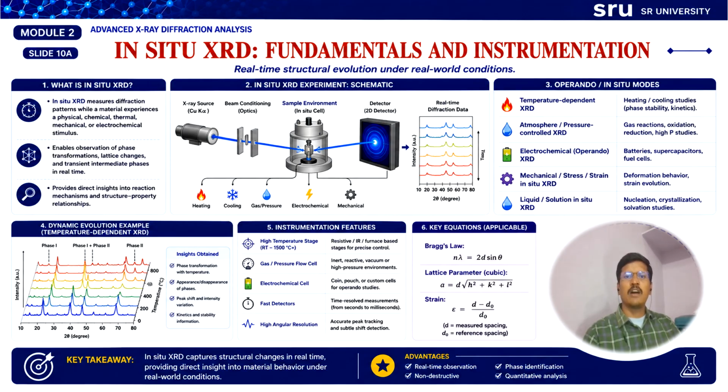The mechanical or stress strain XRD analysis: deformation behavior under external force can be identified during this mechanical XRD. The liquid solution in situ XRD studies give information about the nucleation and crystal growth process in real time.